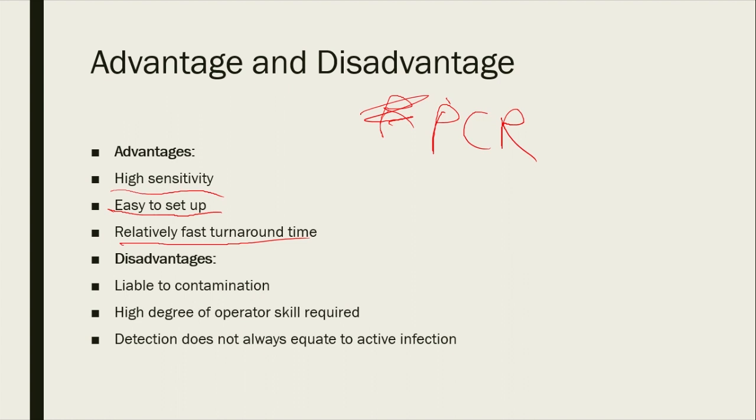You can get something out of it, particularly for virals. It's very difficult to culture viruses in your dish, right? Unlike bacteria, where you can do bacterial culture and then do some tests and see, okay, that is this bacteria, like Pseudomonas versus a pneumococcal, whatever that you're looking at. Viruses, on the other hand, it's difficult. So PCR, it's almost like the gold standard for the high sensitivity, at least before any better assays were being identified. So that is the advantage.